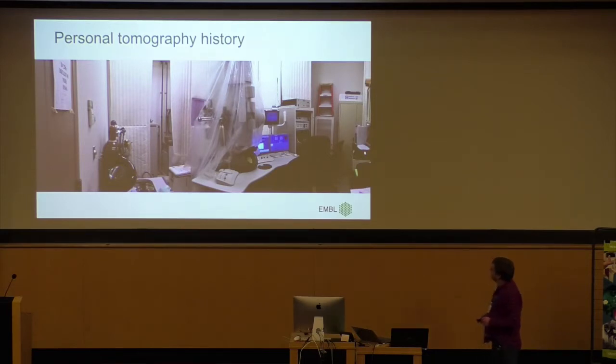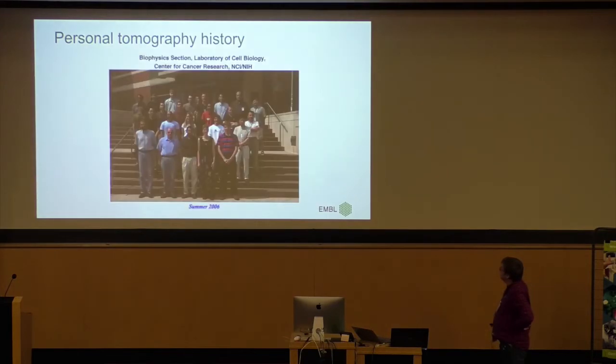But this was Sriram's Polara, and then a few years later, Sriram had a bit of problems with it in 2006, and basically convinced FEI to send somebody over, which was me. So I spent a full year in his lab. I was basically available 24/7 for a full year. They would call me, I would have to be in the lab in 5 minutes to get stuff going. And meanwhile, in that year, we developed at FEI batch tomography.